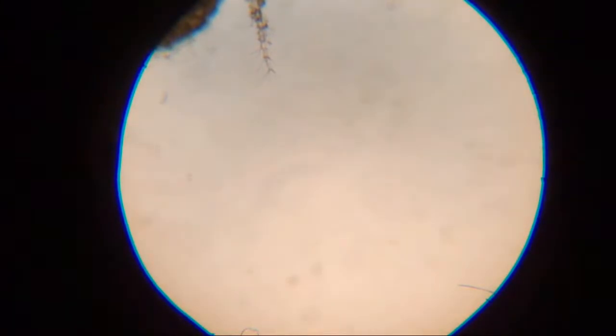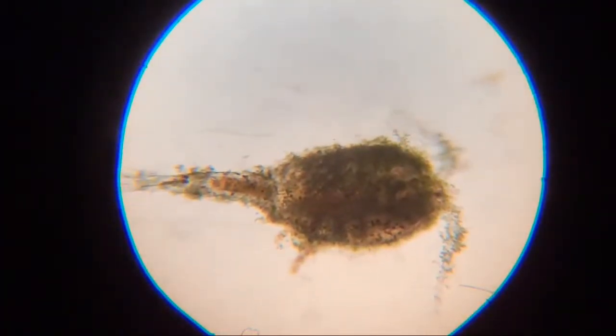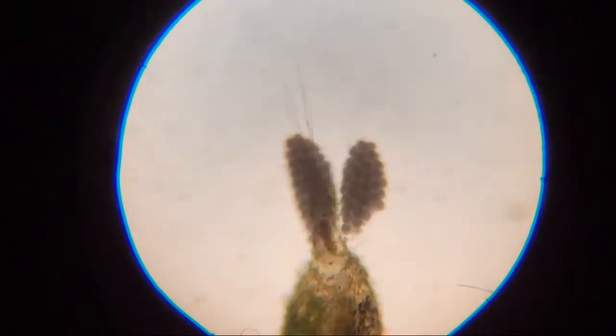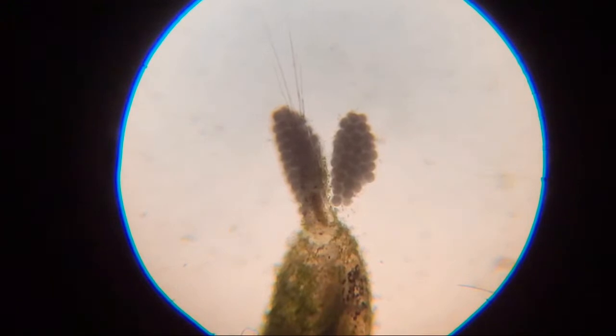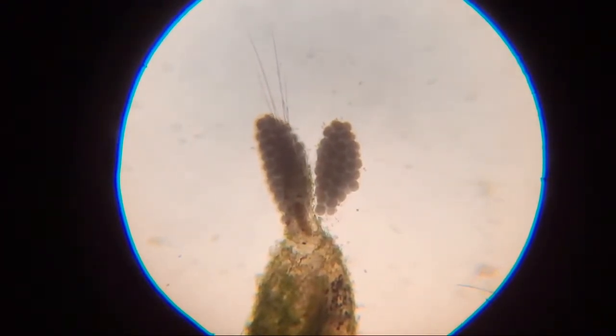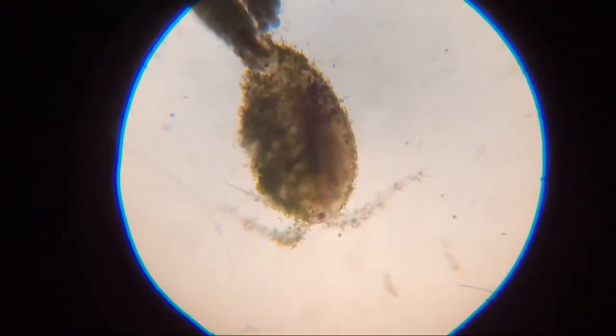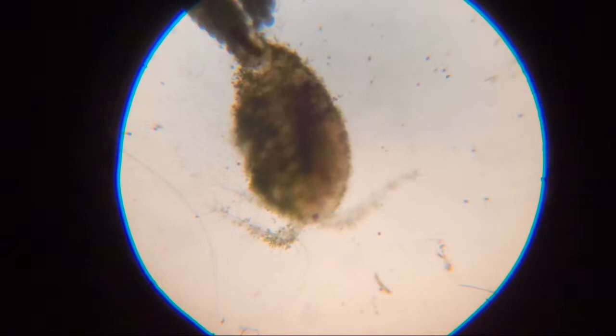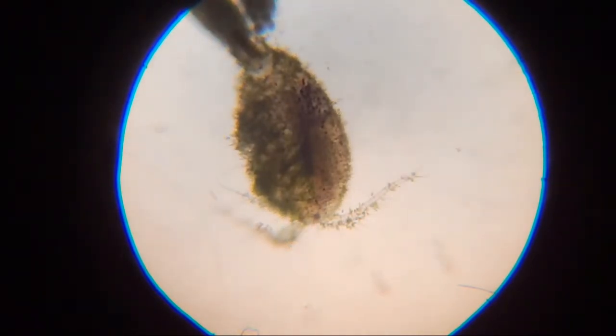You can Google cyclops — this is what the males look like. And the females — they're in a puddle on this slide. I don't like to mount them and kill them if I can help it. The female looks like this, but you can also see something has taken a bite out of those eggs — usually she stacks those eggs up perfectly, but there's some missing. Then they've got their long tail and their eye organ. I think that algae is something dangerous for them.